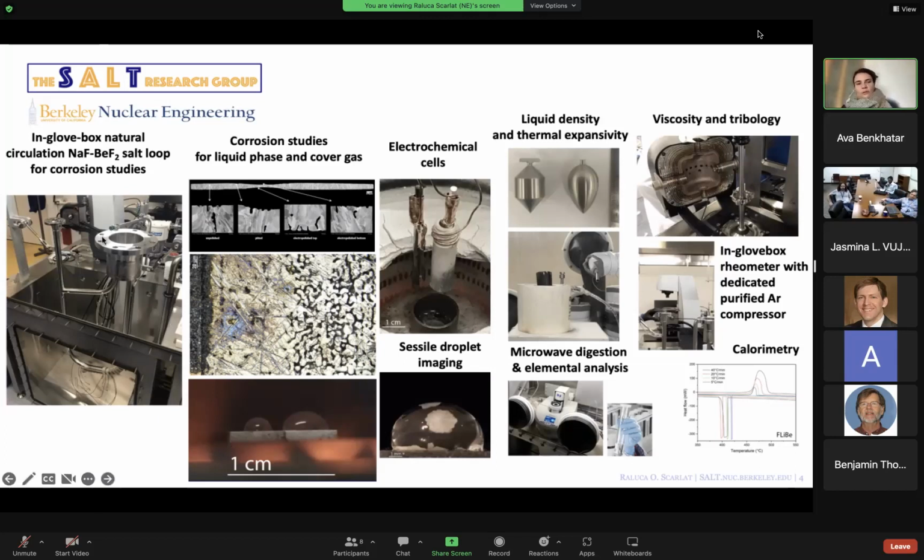of course you have temperature dependent solubilities of your solute, so that might not be representative. And then you have other options for sampling that ensure that you're sampling from a homogeneous liquid, or maybe you sample a big chunk and then you grind it and powder it and homogenize it, and then sample 50 milligrams for digestion. So there are a lot of questions around sampling and making sure it's representative. So that's step 1 of elemental analysis.